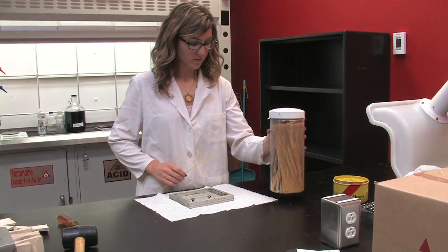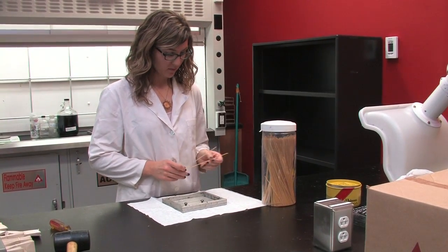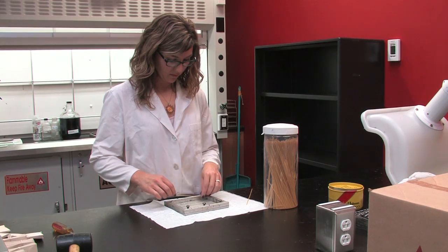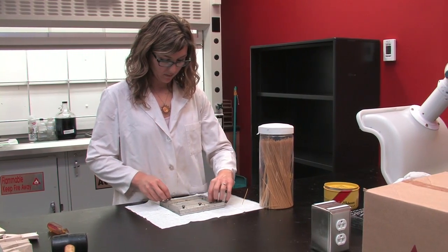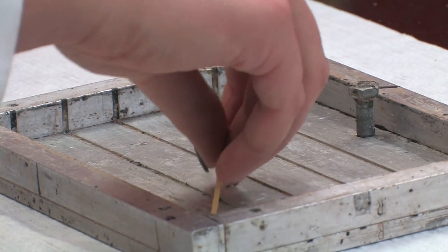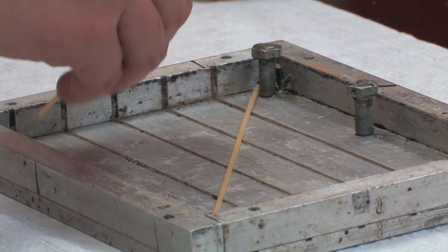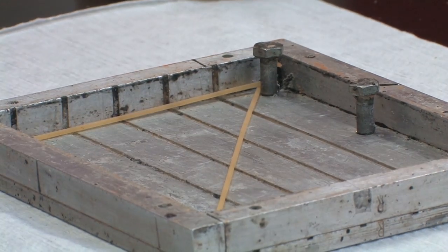The next step is to place two pieces of spaghetti in the embedding tray. One piece diagonally from corner to corner and the other vertically on the left hand side. These will be used as references later once the sample is cut multiple times.